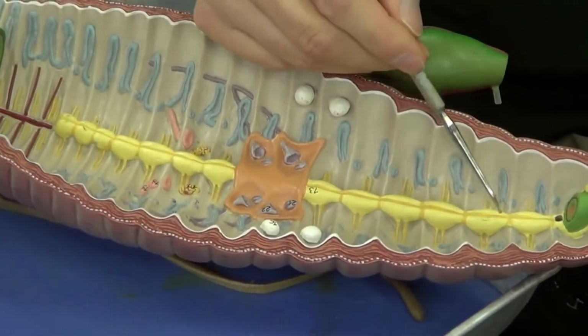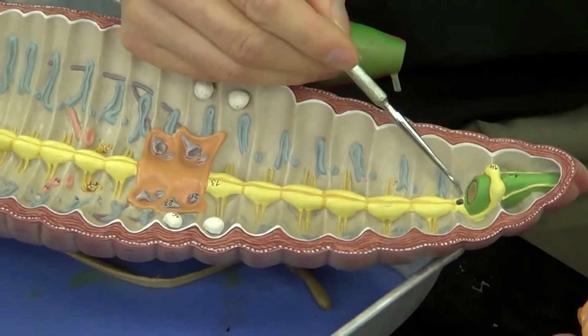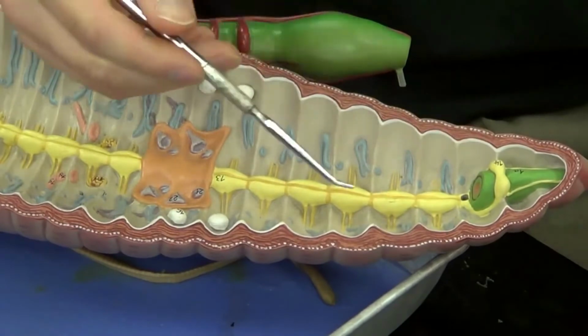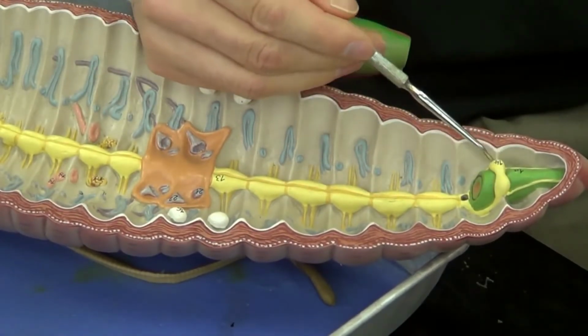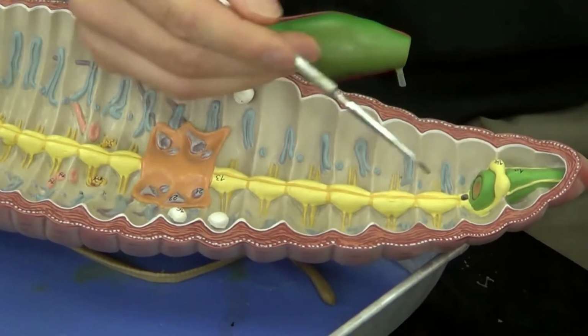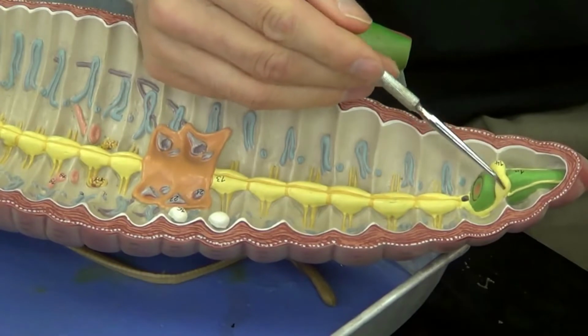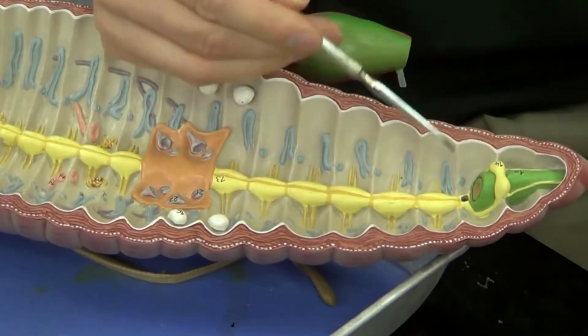Now, at the most anterior aspect of the earthworm, up here, this nerve cord is going to form a large, at least with respect to the earthworm, a large focus of nerve tissue where nerve impulses actually get processed. This is called the brain right here. This is the brain. It's going to be very small in the earthworm, but if we see it, I'll point that out to you.